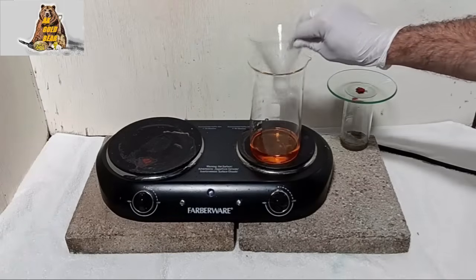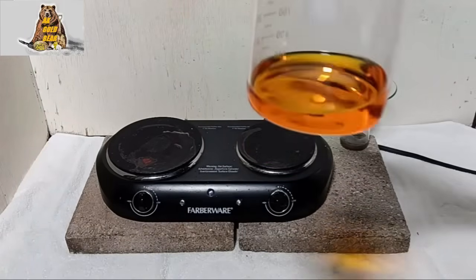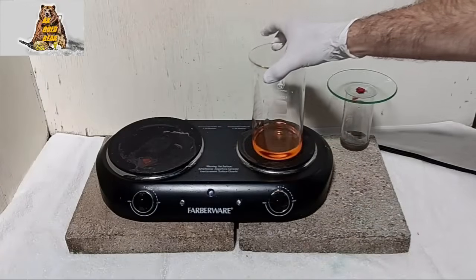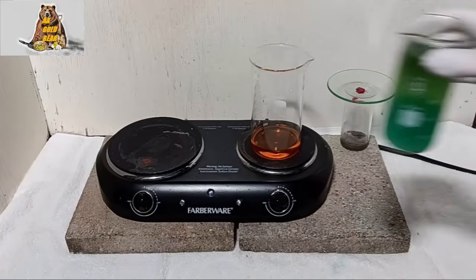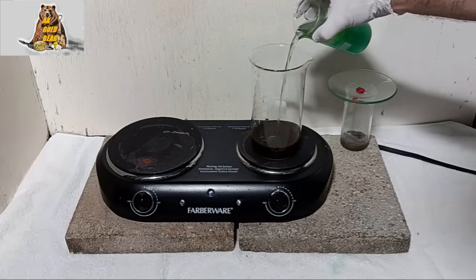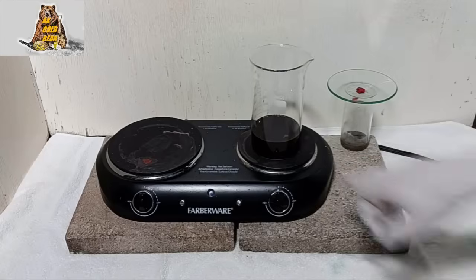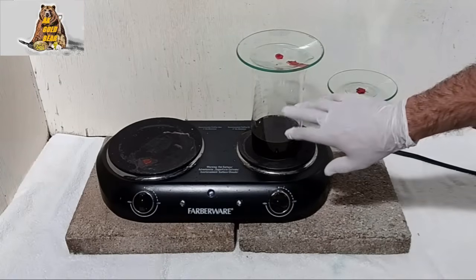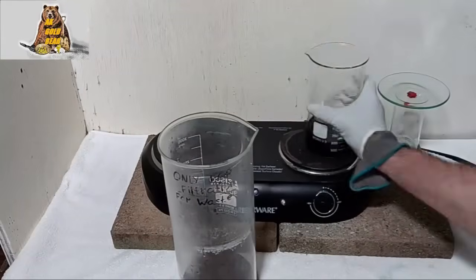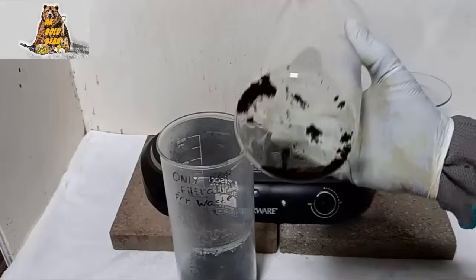Filtration is over. Beautiful golden color of gold chloride solution. Awesome — now I will precipitate the gold with iron sulfate. There you go. Yeah, enough — I can already see some gold flakes. Now I need to heat the solution almost to boil. This is my gold.